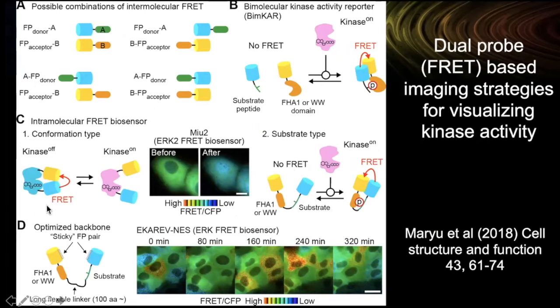I consider this like a Lego kit, and there are many ingredients that you can take and swap out to build your own specific sensor. And of course, it's better to first look around if the sensor already has been created by somebody else. That saves a lot of work, but in principle, it's doable.